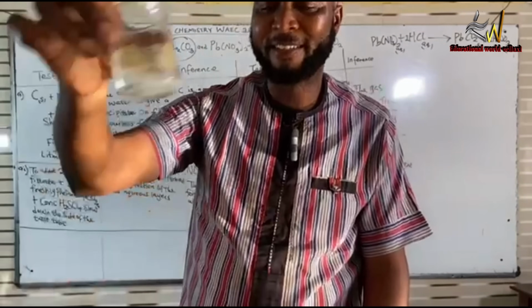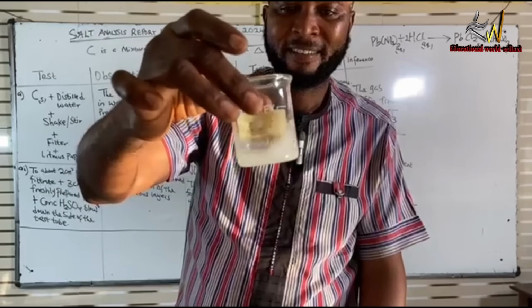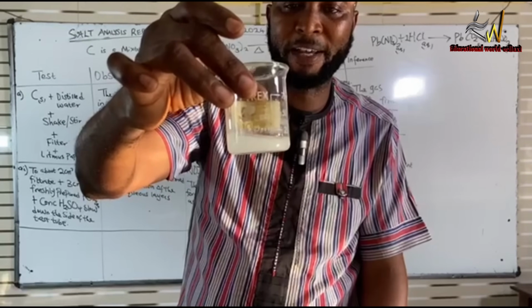Alright, don't forget our lead 2 precipitate has reappeared again on cooling.